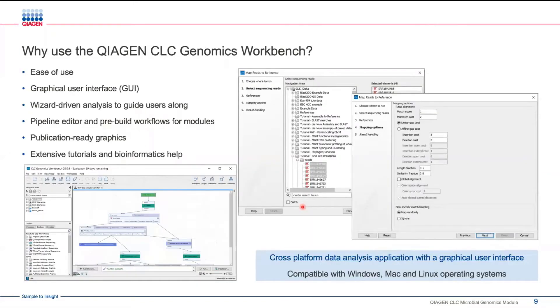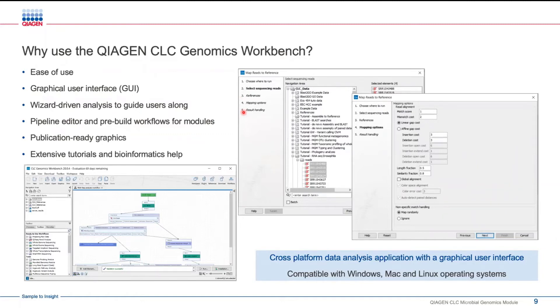One of the reasons to use the Genomics Workbench is, of course, the graphics. But I want to point out a few key features to take home today. One is the ease of use — today we're looking at an application that is very consistent in the way it is executed. Everything is done through a graphical user interface, and it is wizard-driven, providing a step-by-step guide through the analysis asking for sequencing reads, references, and additional parameters laid out as step one through step five.